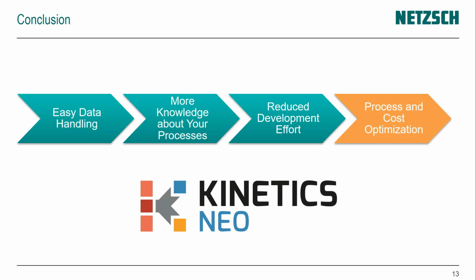We are now at the end of the webinar. We have shown you that the data handling of Kinetics Neo is easy, and that we can increase your knowledge about your process with a minimum of experimental effort based on a few DSC measurements, without expensive and time-consuming trial and error experiments. Kinetics Neo can reduce your development effort, and this improves your processes, your products, and cost efficiency.